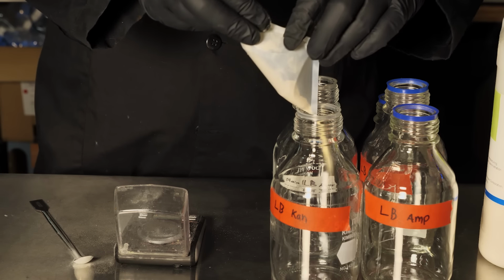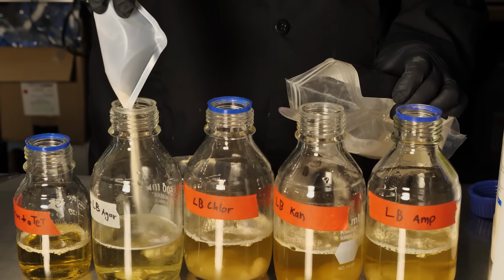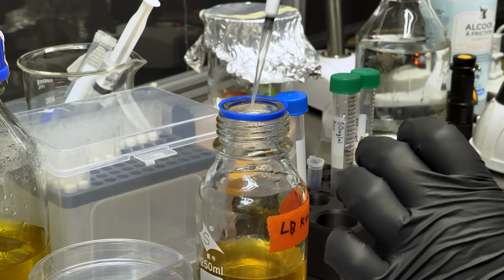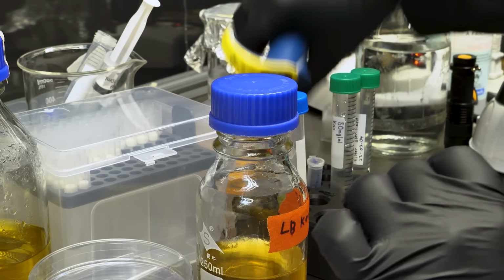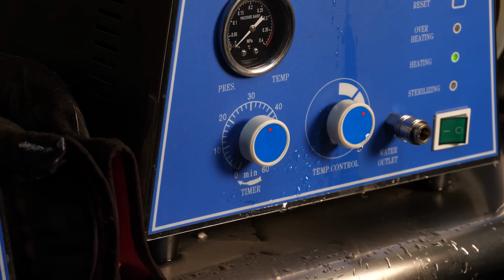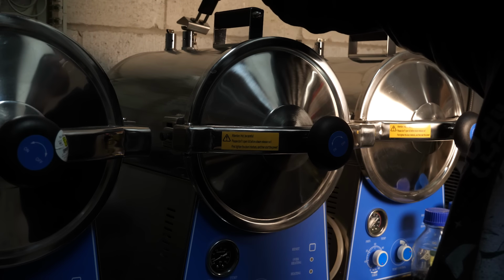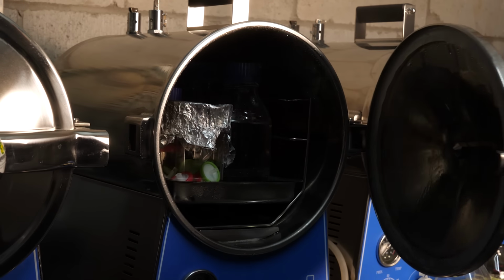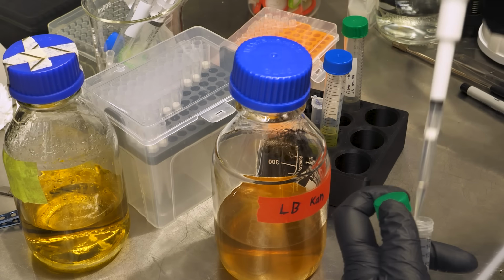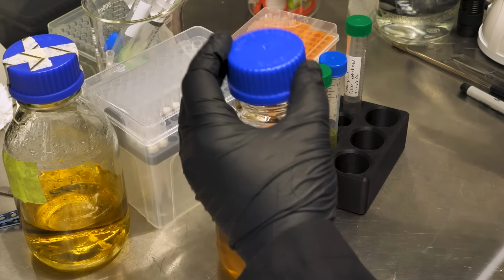this. I'm mixing up multiple bottles with and without agar, but no antibiotics yet. These get added after sterilizing as they're heat sensitive. Then we load the bottles into the autoclave and let it cook for half an hour. When the cycle is done, the autoclave is carefully depressurized, and then the hot bottles can be removed and brought back to the lab. At this point, the agar will have melted, so while it's still molten, we can add the correct amount of antibiotic solution.